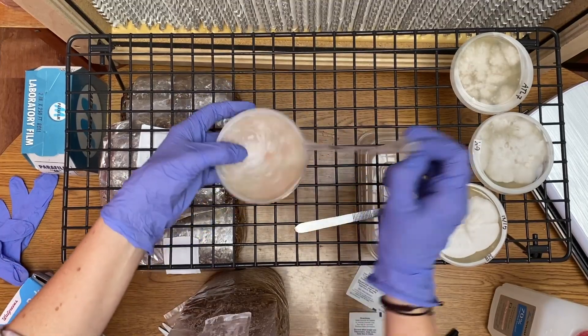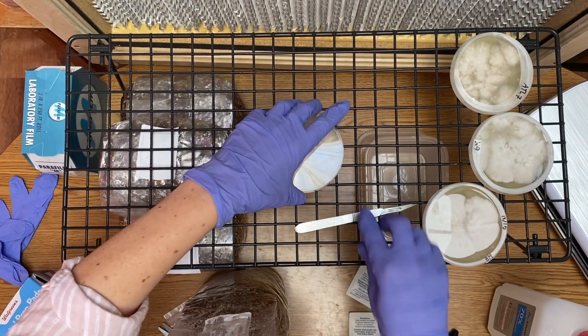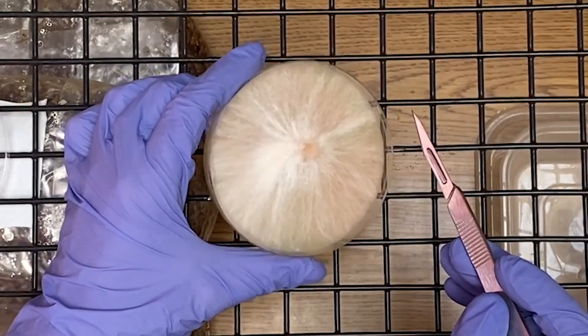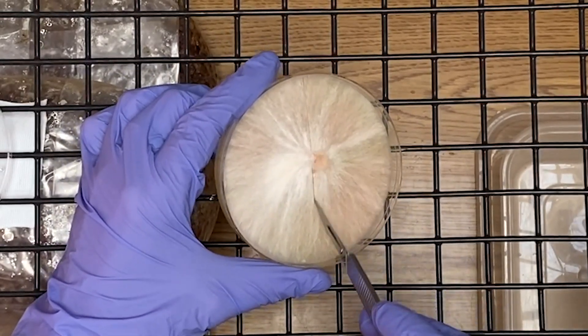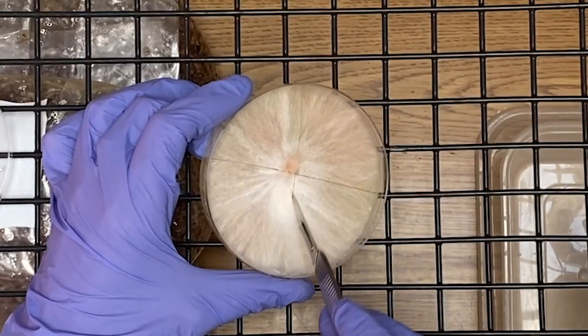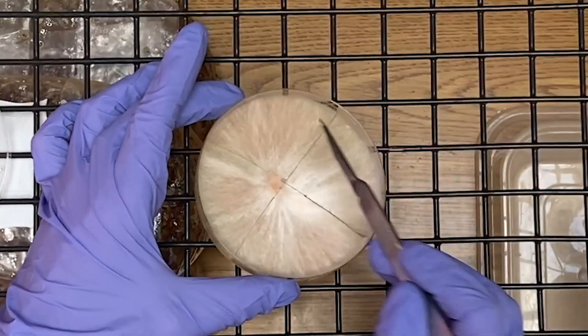Next, let's prepare the petri dish. First, remove the parafilm and open the lid. Then, with a sterilized knife, cut 8 wedges in the petri dish. By doing this, it helps displace the mycelium throughout the spawn bag, which causes faster colonization.